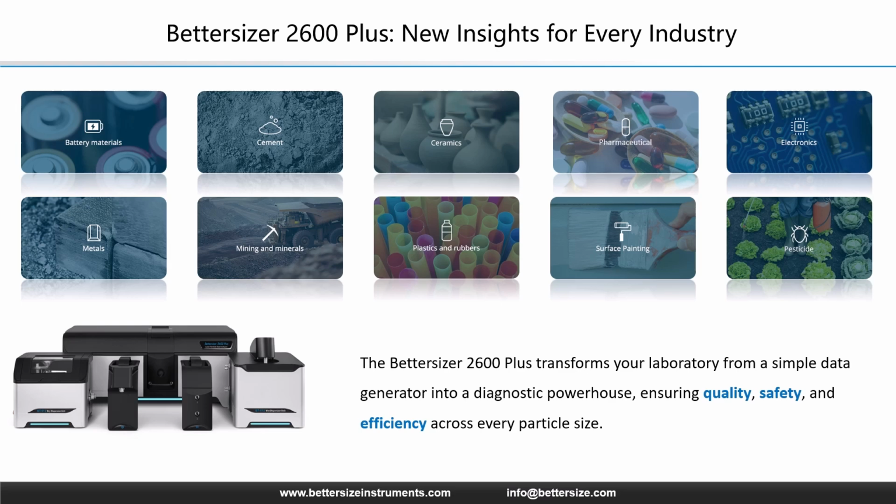In ceramics, we move from standard QC to ensuring durability. Our high resolution detects the coarse tail that causes structural cracks. This is the power of the Bettersizer 2600 Plus. It transforms your laboratory from a data generator into a diagnostic powerhouse.